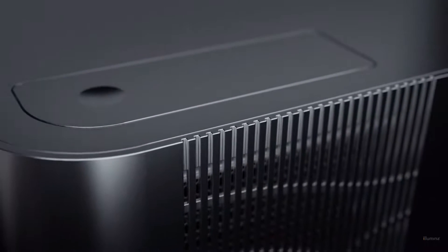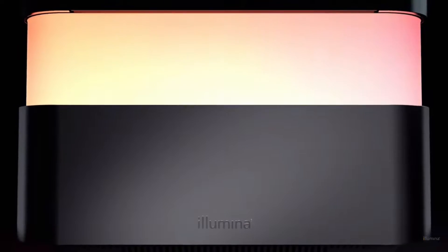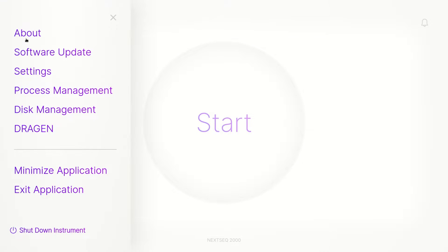To power cycle the NexSeq 1000 and 2000, complete the following steps. From the control software home screen, select the menu icon in the top left corner, then select shut down instrument.